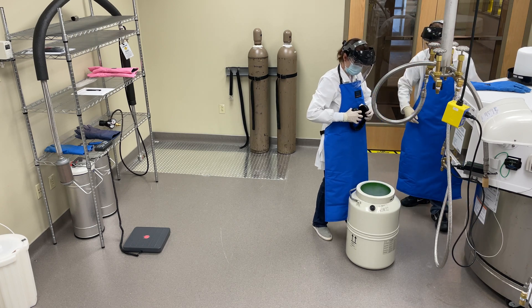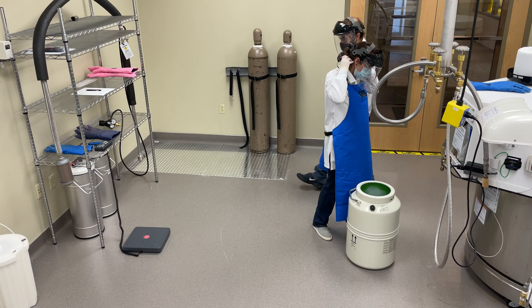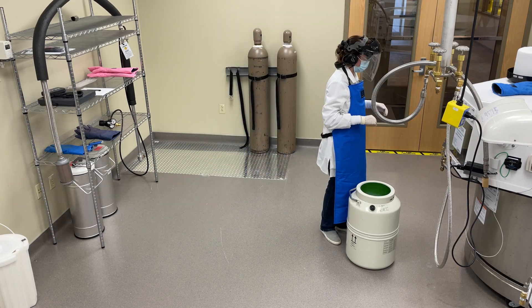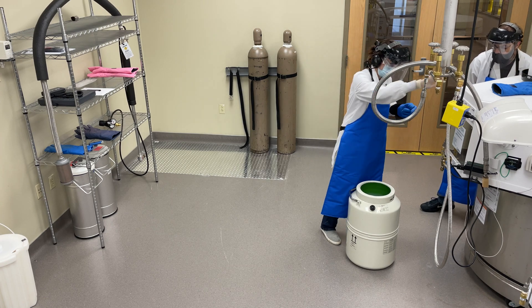Make sure to wear appropriate PPE that follows established safety protocols, including a lab coat, face shield, cryo gloves, cryo apron, ear protection, and a portable oxygen monitor.